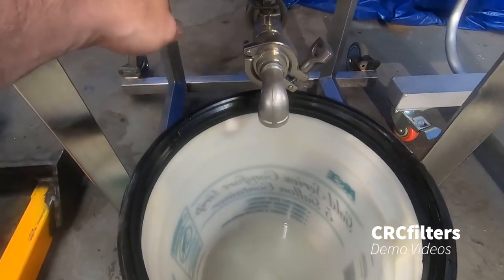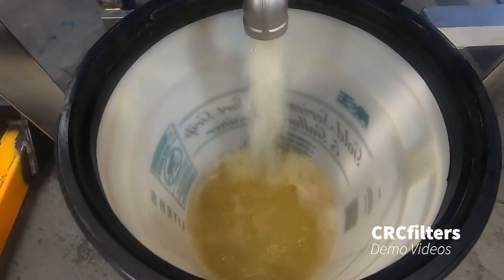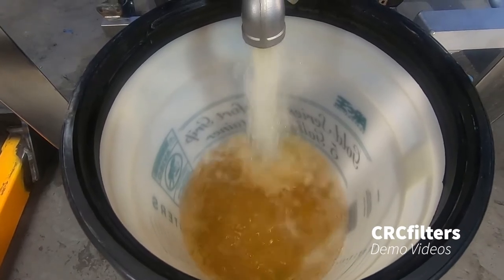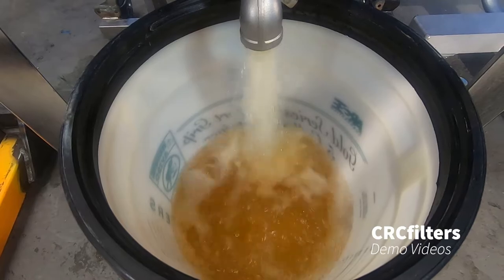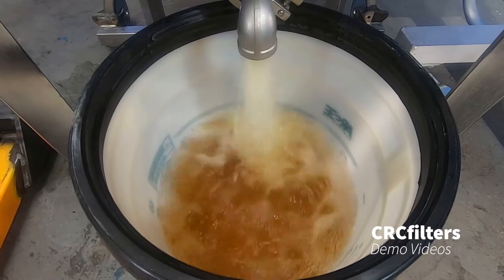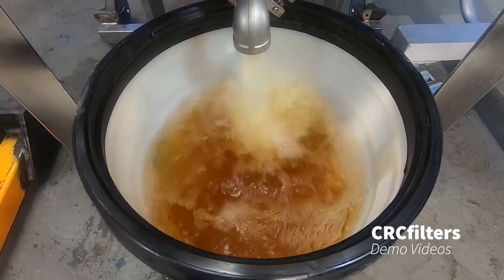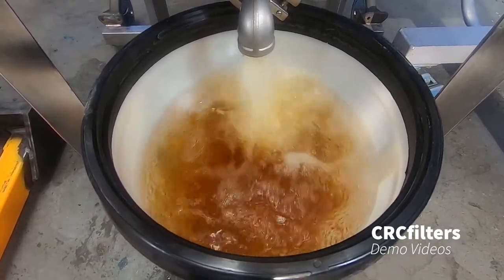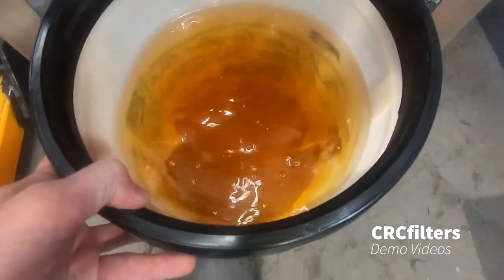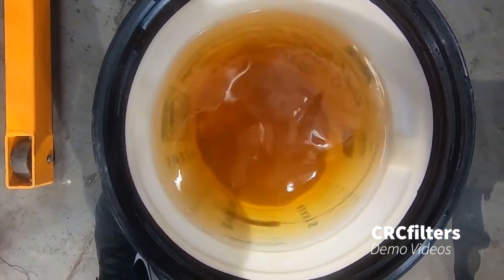We're going to open the valve here and see what we got. That is at a dilution rate of roughly 30 gallons for 20 pounds of material. You can see what that looks like — that would usually be the perfect thing.